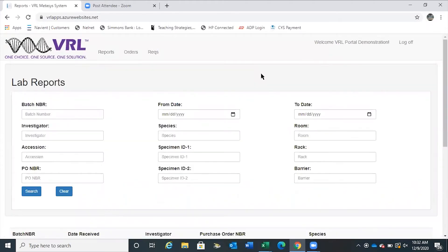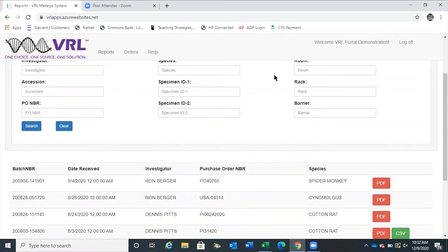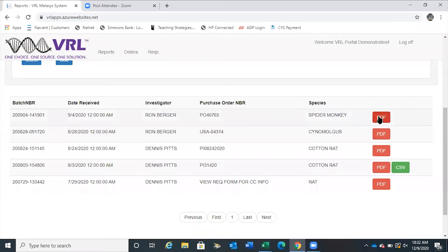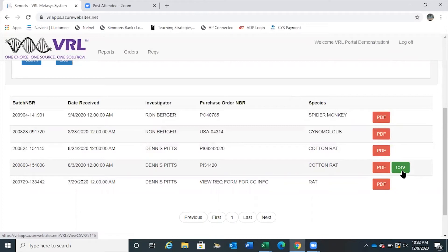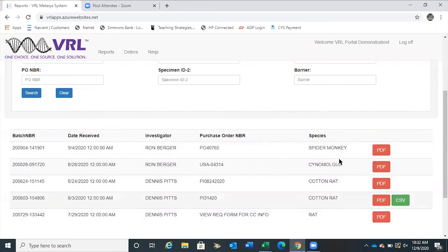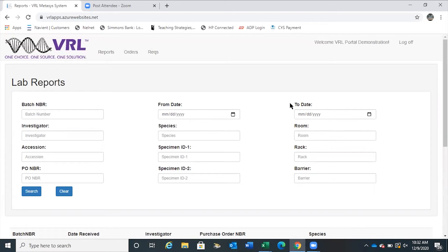When you first log in to the Client Portal, it brings you to the Reports page. If you scroll down, you'll see that all reports are generated in a PDF. You can also request a CSV file if that would be easier for your institution to use. All of your results ever generated by VRL will appear here in chronological order. At the top there are several search fields depending on how much data you have given to VRL — this is now searchable. You can search by species, by room, rack, barrier, and many other methods.